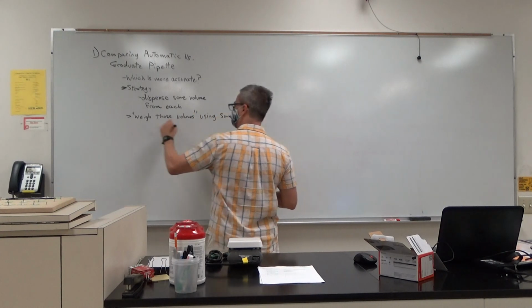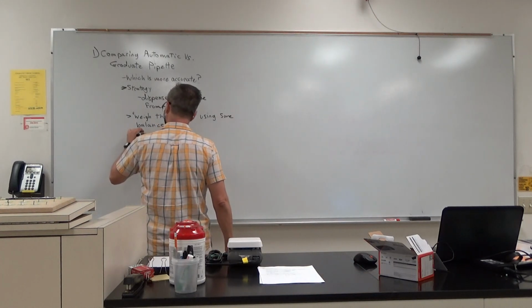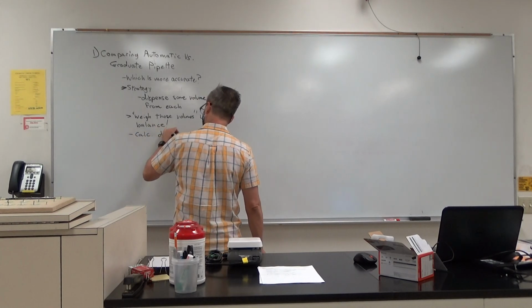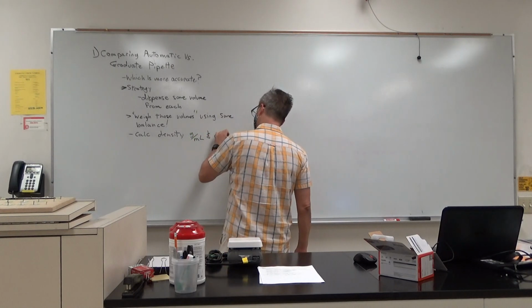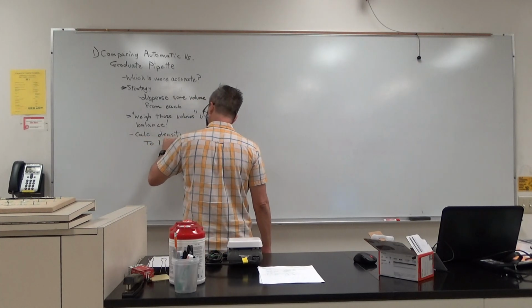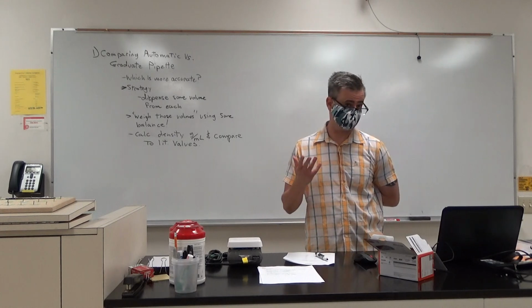Using the same balance. Okay. All right, and then calculate the density. Grams per ml is the most common way of expressing density. And compare to literature values. I believe in the worksheet I even had you do a percent difference to see which one has the lower percent difference.